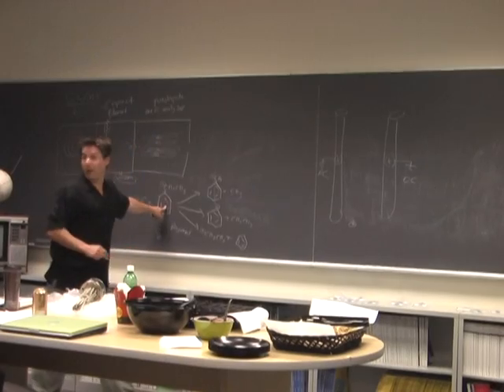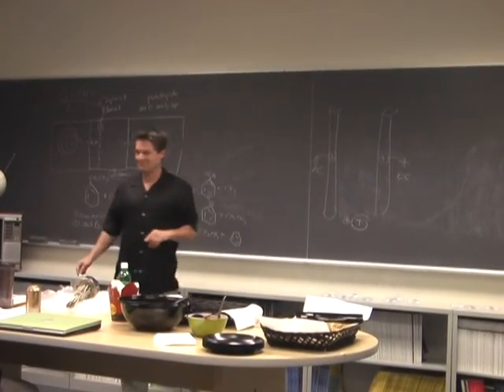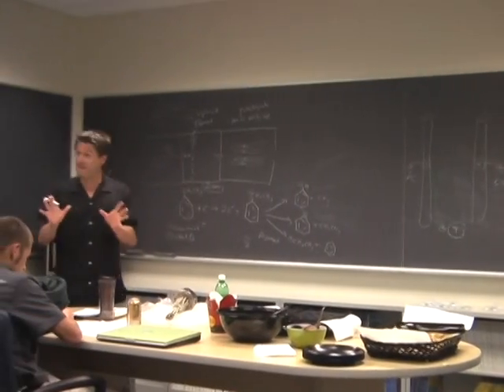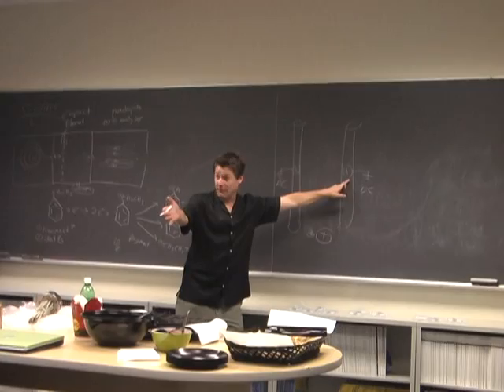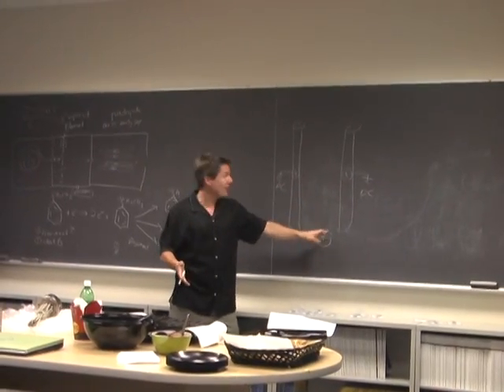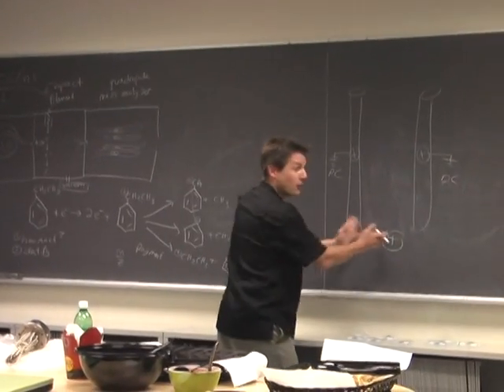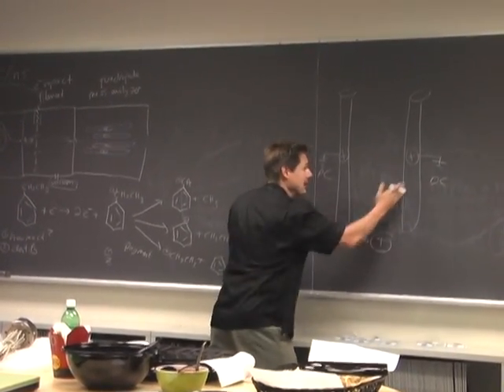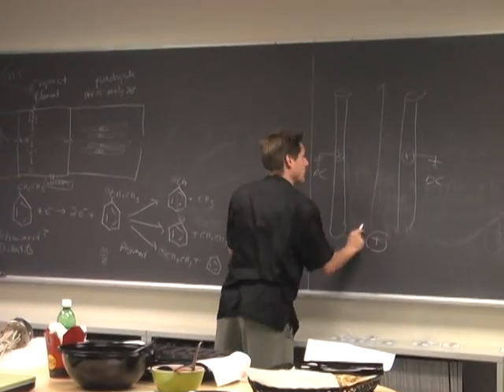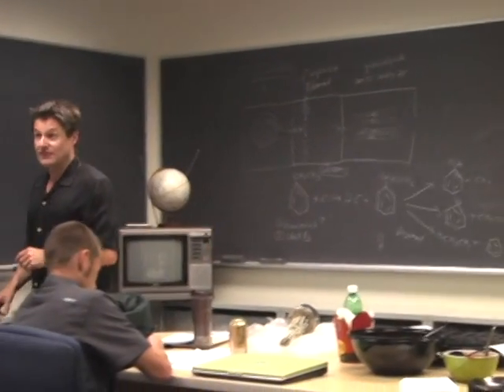And let's say I have a big one, just to make it simple. Big ion, small ion. Let's show how it separates these, if it does at all. So if these are positive, like 7th grade principle number 1, and these are positive, are they attracted or repelled? They're repelled. So these ions, whether they're small or big, just on electrostatic attraction or repulsion, are going to keep away from the poles and just move straight through. It's not going to separate these ions like I want to, so that doesn't work.